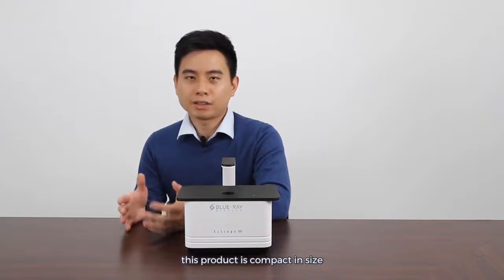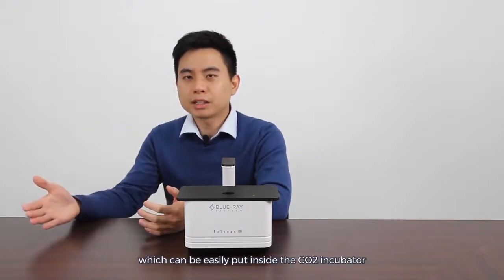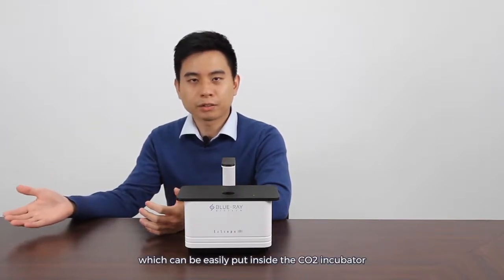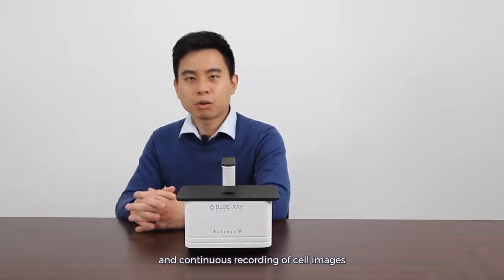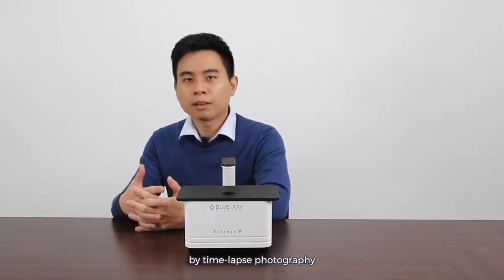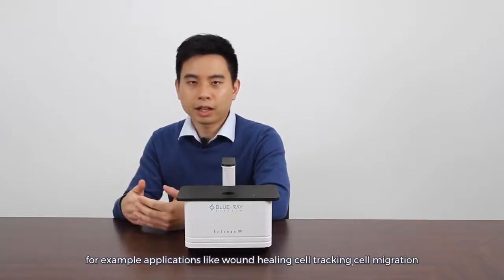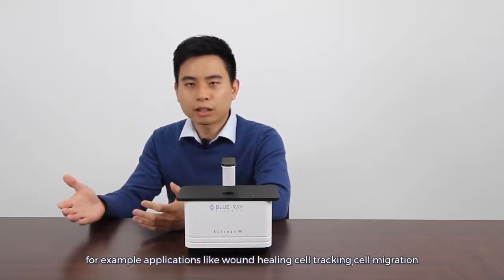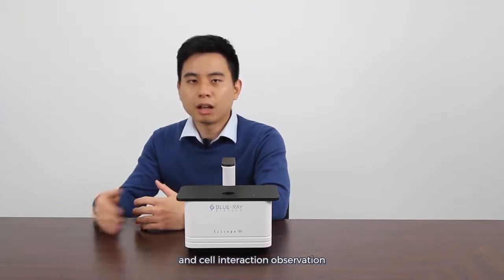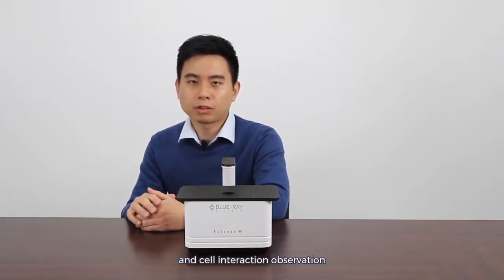This product is compact in size, which can be easily put inside the CO2 incubator, and continuous recording of cell images by timelapse photography. For example, applications like wound healing, cell tracking, cell migration, and cell interaction observation.